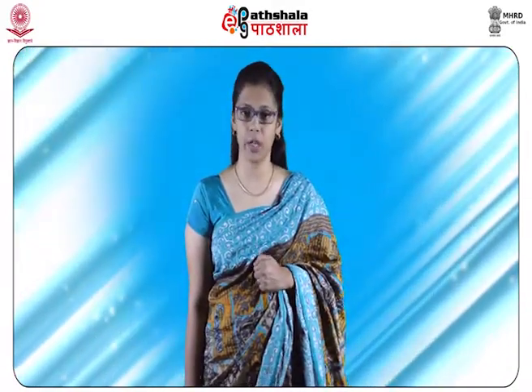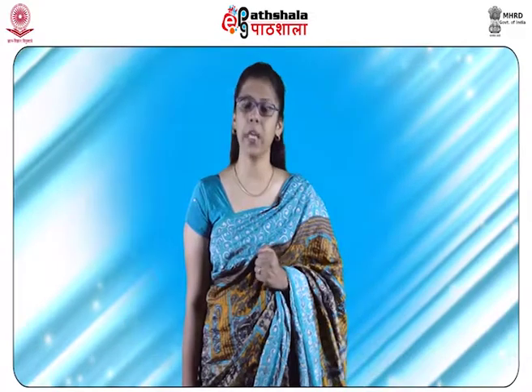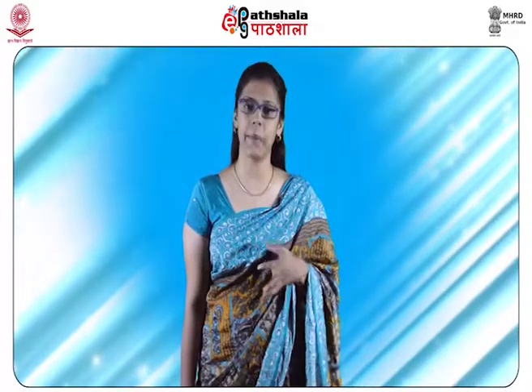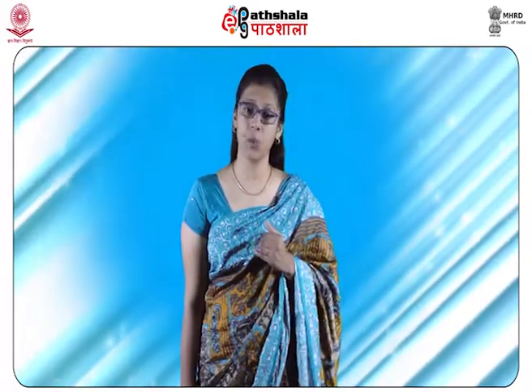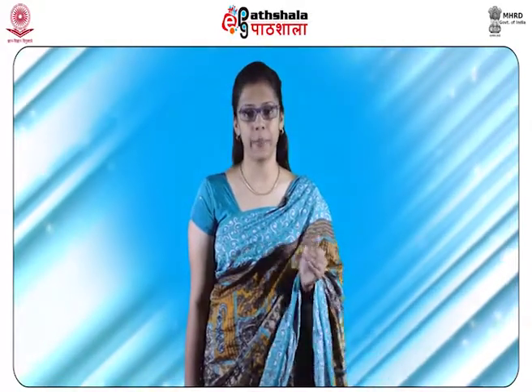Now, the next step is dye analysis by high performance liquid chromatography, that is HPLC. This technique was introduced in the 1960s. In forensic science, this technique has been widely applied for qualitative and quantitative analysis of drugs and metabolites, organic and inorganic explosives, marker dyes and inks. There are various advantages of HPLC over TLC, for example, better resolution of dyes, quantitation and consistent retention times of separated components.